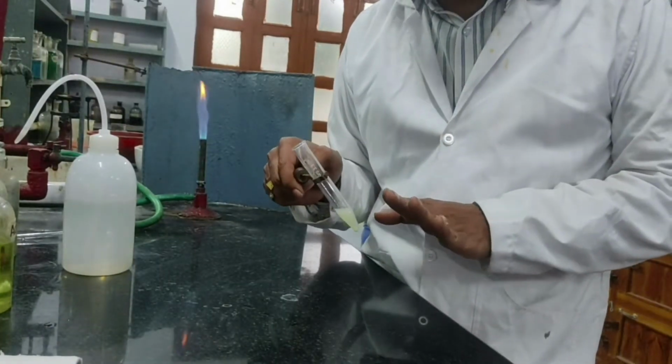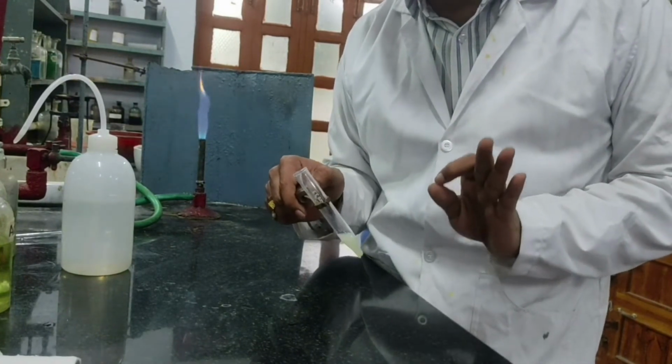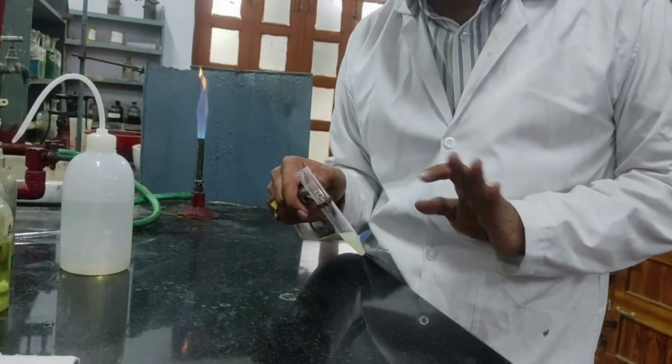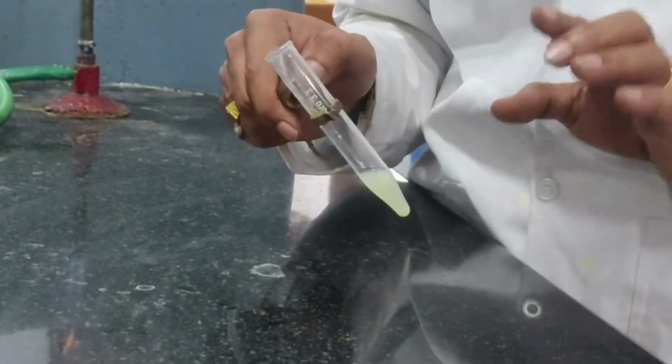Now this is to be divided into two parts and tested for the presence of nickel and cobalt ions. But I told you cobalt is not present in our syllabus, therefore it is not given. So this is to be tested for Ni+2.